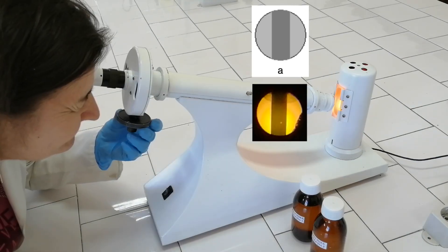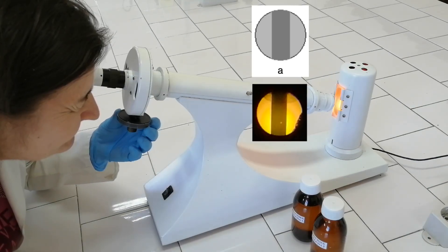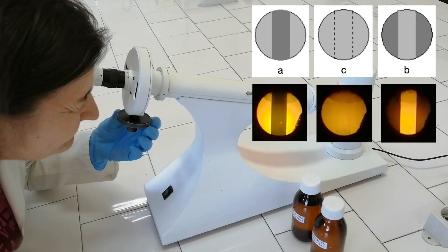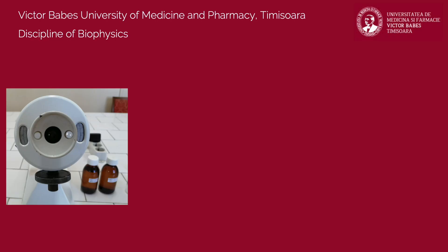Continue to rotate the knob until you find image B. In between images A and B is located image C, corresponding to the uniform light field of minimum illumination. Read the rotation angle at this image. For reading the angle on the Vernier scale, use the following steps.